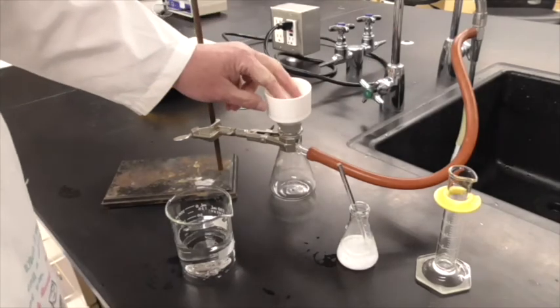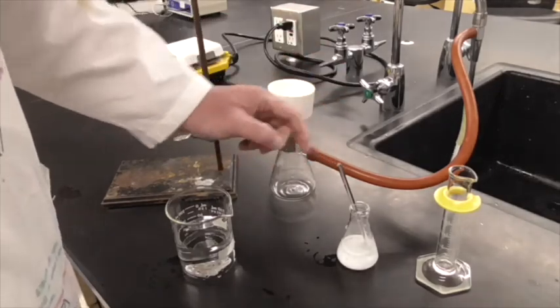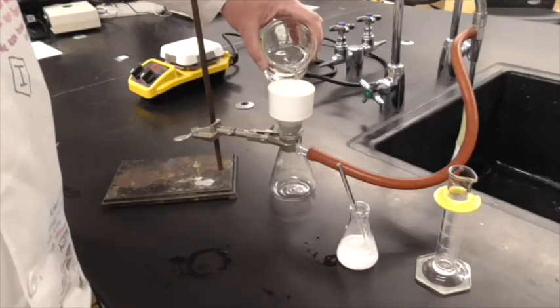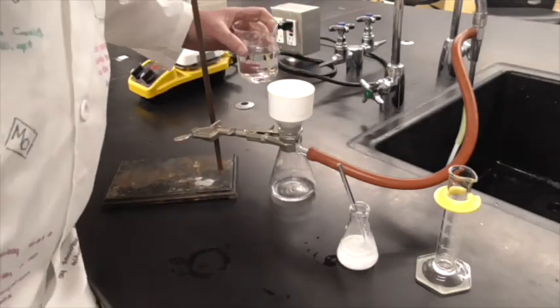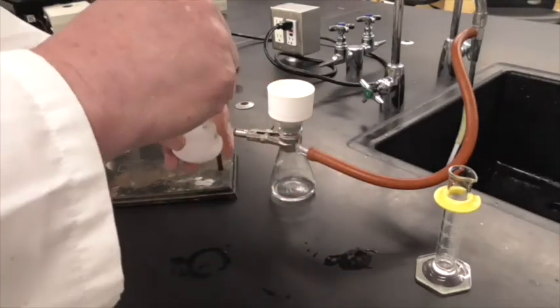to turn on the vacuum, so that will cause the vacuum to start pulling that filter down and whatever's on the top down. I'm going to add some water to get that filter paper to lay down nice and flat, and you can see the vacuum's pulled the water through. So we're good. So we can now dump our aspirin solution in there.